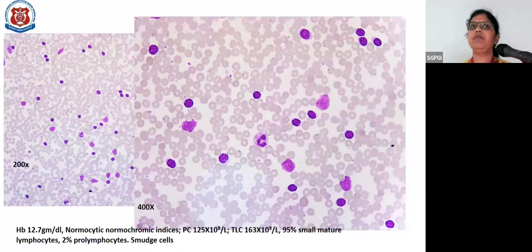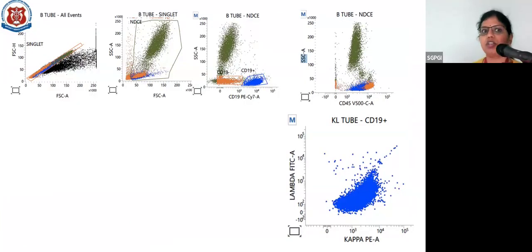So what we could tell him was a chronic lymphoproliferative disorder, but the cause of epistaxis was still not clear from this. So the CLPD panel from the peripheral blood sample was run. Here you can see the initial plots. This is the plot where we do gating in CLPDs by CD19 versus side scatter. We can see that the CD19 population is increased as compared to the CD19 negative. This is one of the abnormalities which we were expecting. And these cells are showing bright expression of CD45.